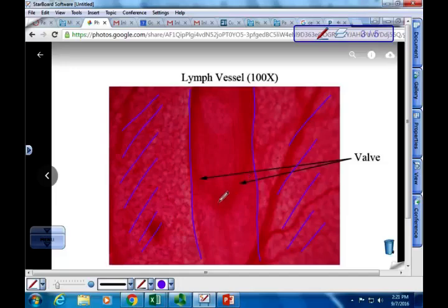The only other thing we're identifying within this lymphatic vessel is the fact that this darkened area that we see here, that's one half of it. See this other darkened area right there? This darkened structure that we see right there is a valve. That's one of those one-way valves. It looks very similar to what we see in terms of atrioventricular valves, or more closely actually to the semilunar valves. Okay? So if the blood tries to come back, blood's going to go this way naturally, can push its way through. I'm sorry, in this case lymph.